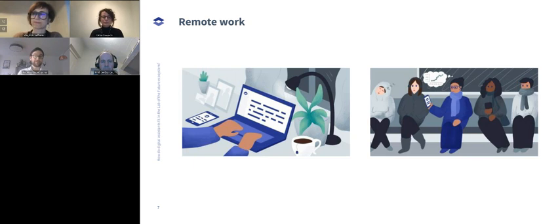And therefore, I think that could be a part where digital assistants could play a role, because basically they could bridge that gap somehow, so that you go with only one assistant that is cleared with security and all of that, and then hook into various instruments or look for various monitoring systems. So something like that would really be a huge leap forward.